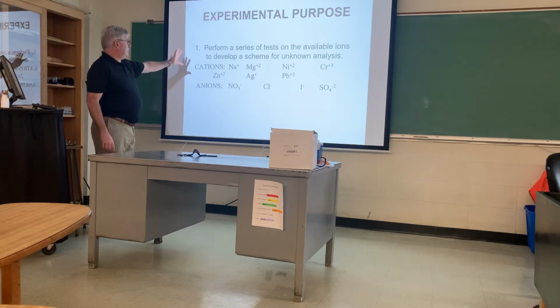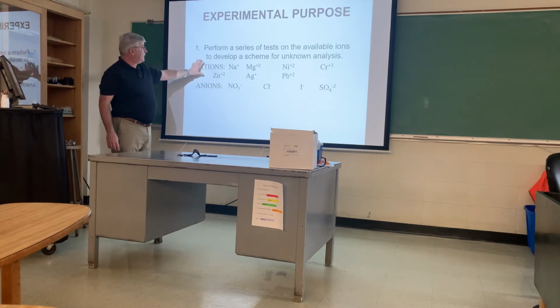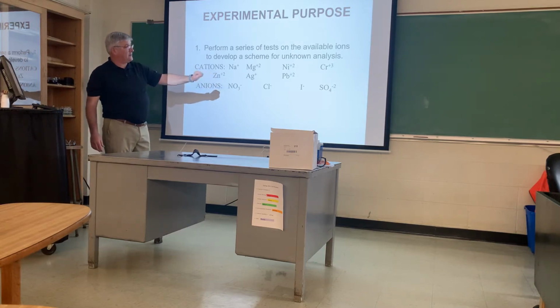So the true purpose of this experiment is to identify these ions. The cations that we're going to be looking at are sodium, magnesium, nickel, chromium, zinc, silver, and lead. And then the anions are nitrates, chlorides, iodides, and sulfates.